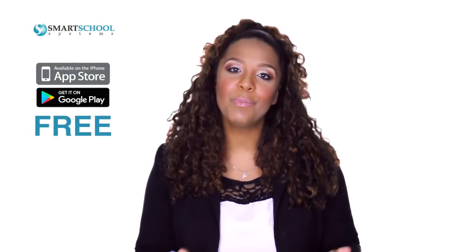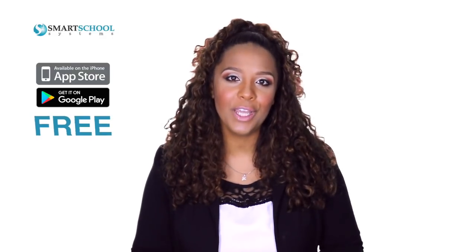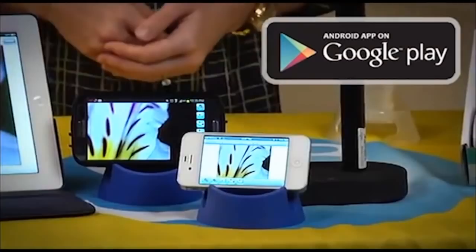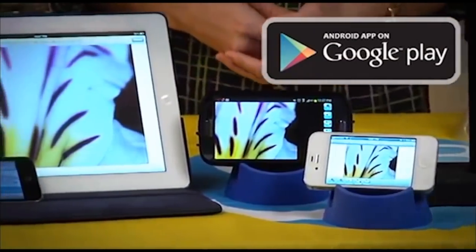But with the addition of its free iOS and Android app, the Smart Microscope iGo 2 gives you the ability to take pictures and record videos on your iPhone, iPad, or mobile Android device. The iGo 2 is a great tool for showing your students what they're looking for in their traditional microscopes, and a thrilling way to review what they've already seen.